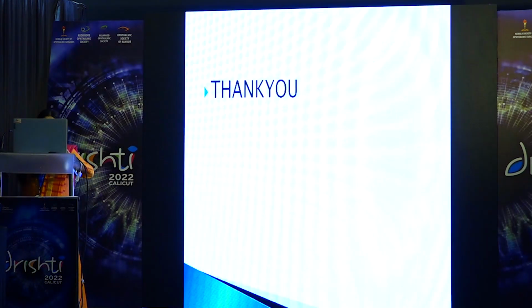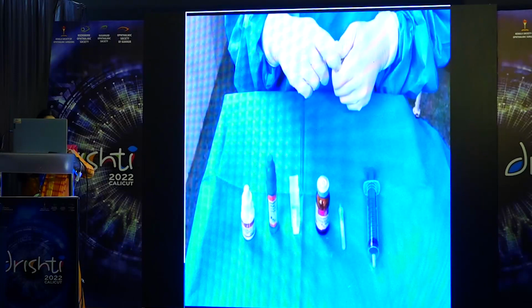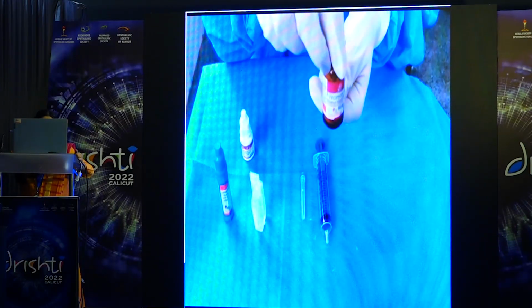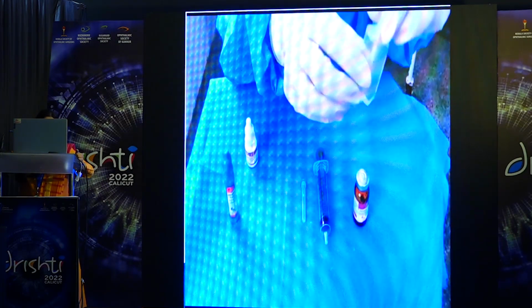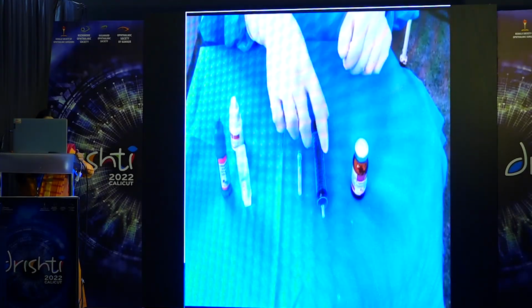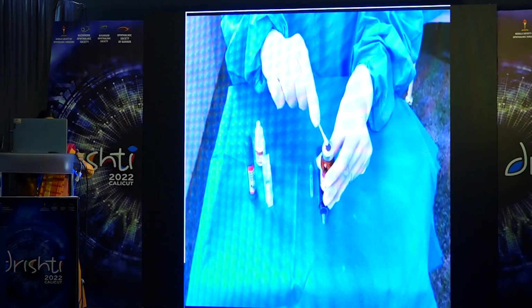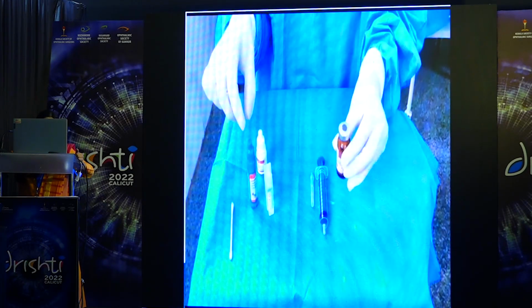It's a short video showing preparing fortified antibiotic. The ophthalmologist herself is preparing the fortified antibiotic under sterile aseptic precautions. She's first showing the injection vial, the vancomycin vial, then the sterile bottle, artificial teardrops, emptied bottle of antibiotic, syringe and needle. She's cleaning the vancomycin injection vial.